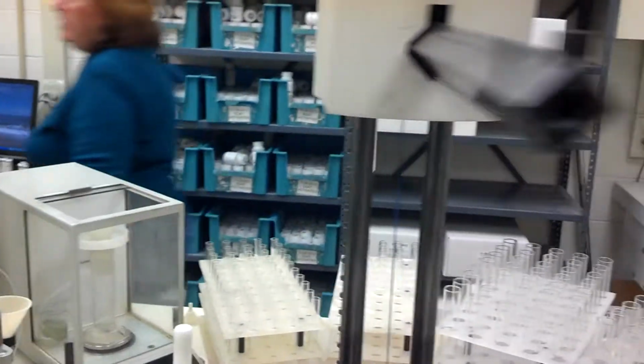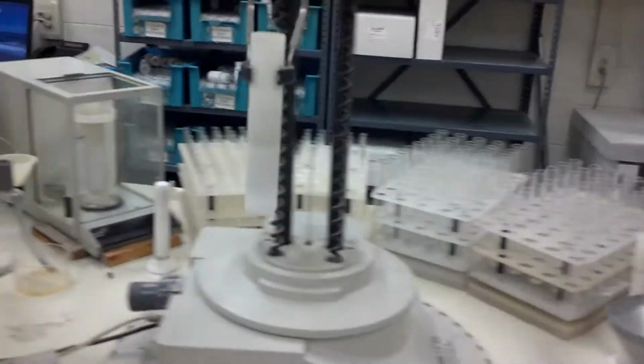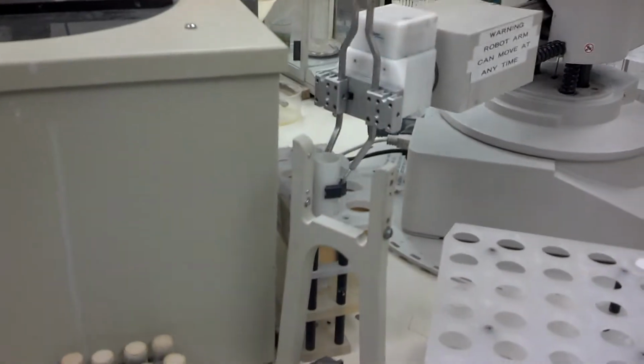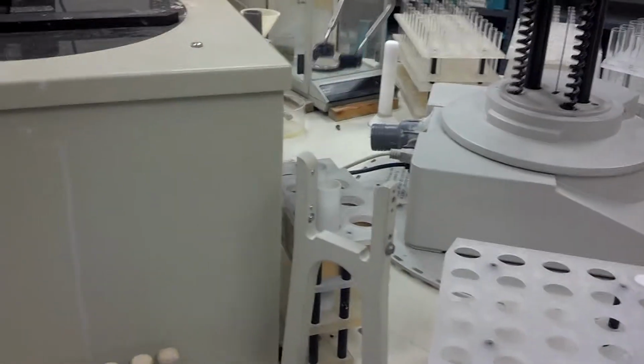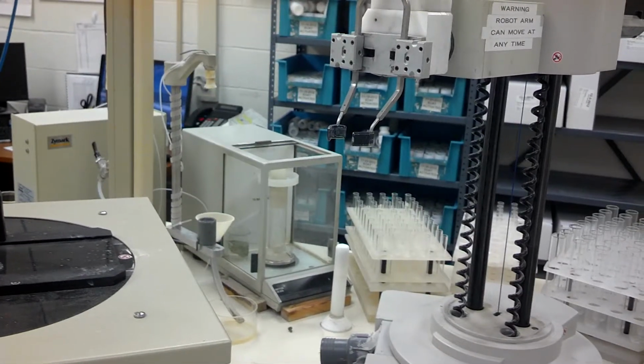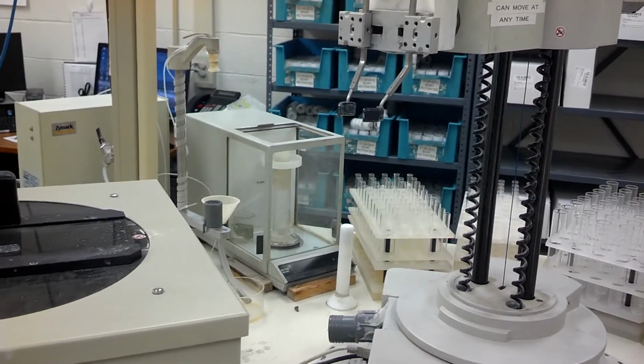You have to take the tare weight. Oh, you've got to weigh the vessel, because we're getting a weight. Okay, so you've got to weigh a vessel before you put the powder in, and then after? Yeah, we do a tare on the vessel, and then we weigh the vessel before we actually add the water. So that's why we don't, because that vessel has to be tared first.